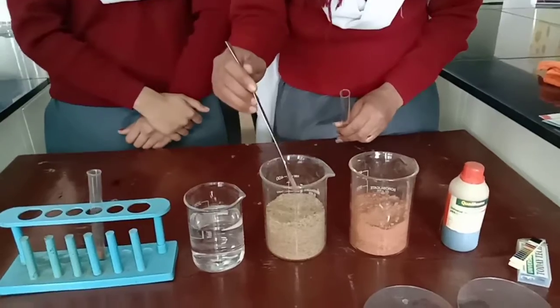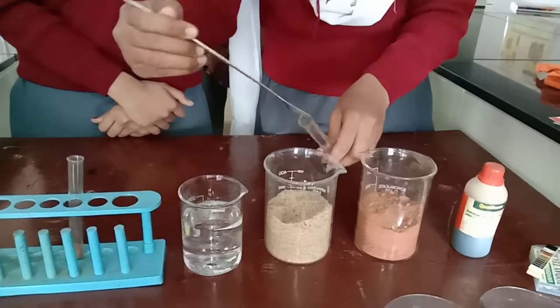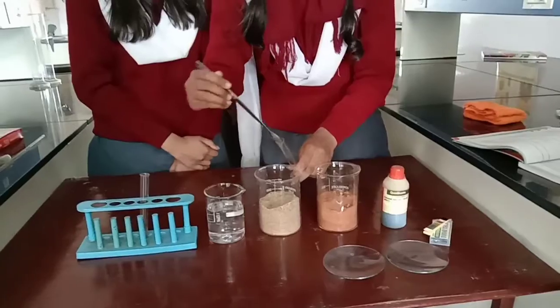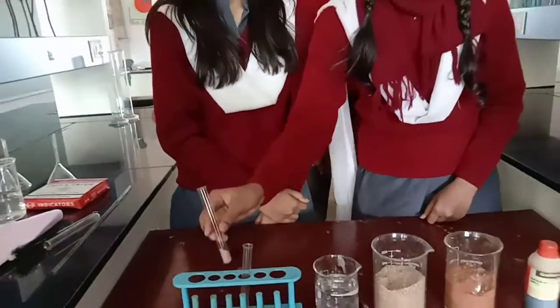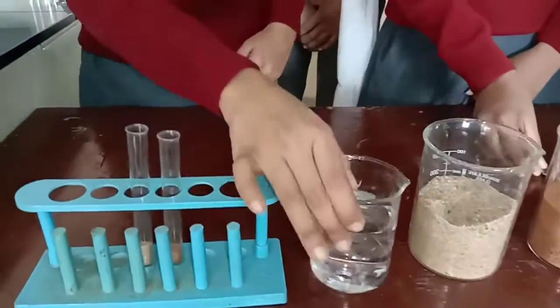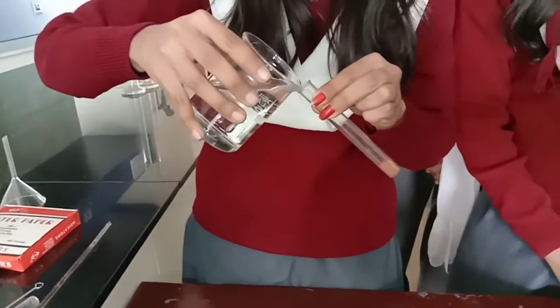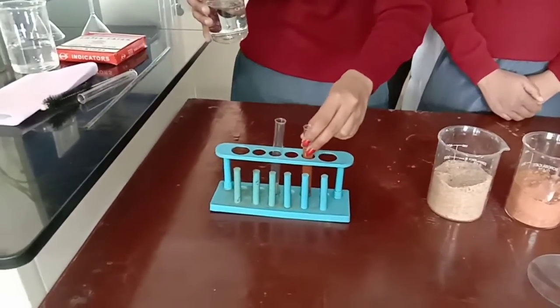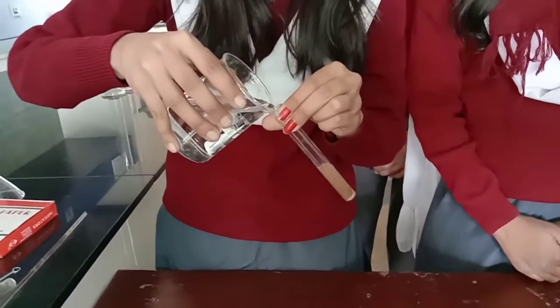Now the procedure. We will take 1 tablespoon of soil from each soil sample. From both the soils we have taken the soil into our test tubes with the help of a spatula like this. After that, 10 milliliters of water is added to the test tubes respectively. In both the test tubes we add about 10 milliliters of water.